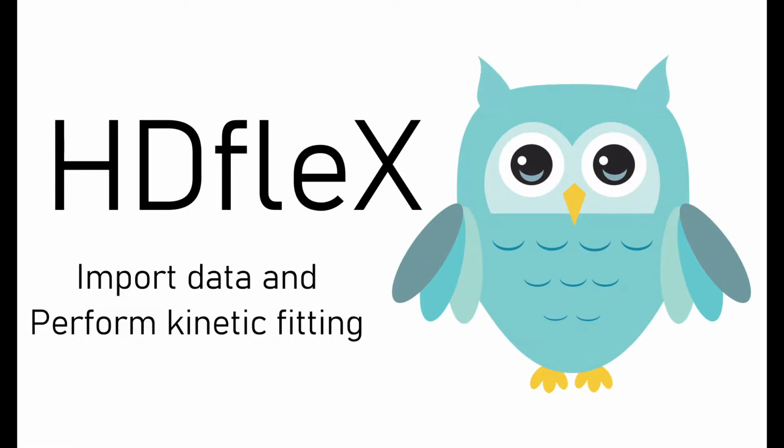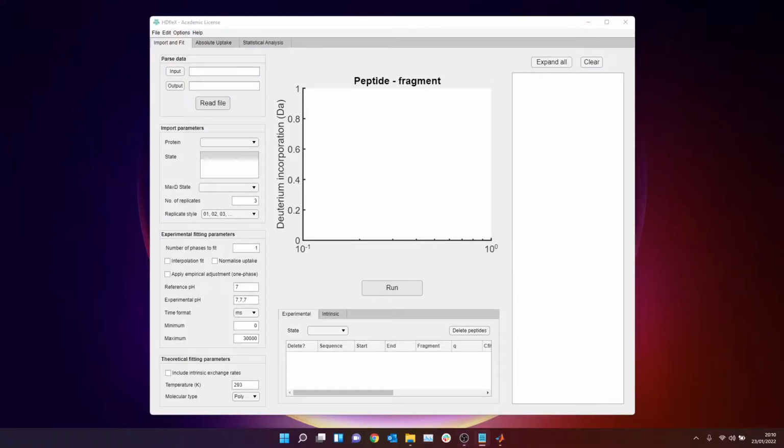In this tutorial, I will show you how to import your data into HDfleX to perform kinetic fitting of the HDX-MS data. First, we need to locate our input file and output folder.